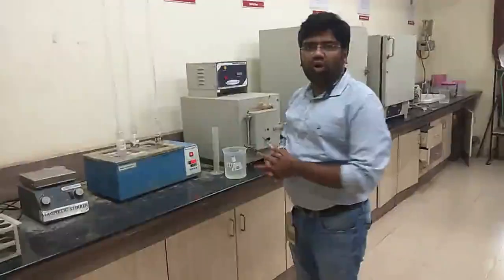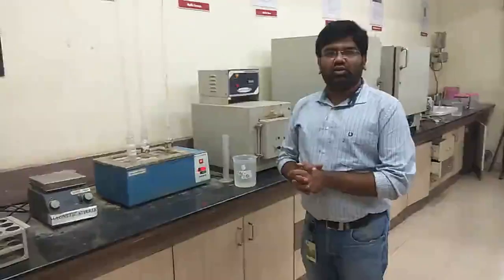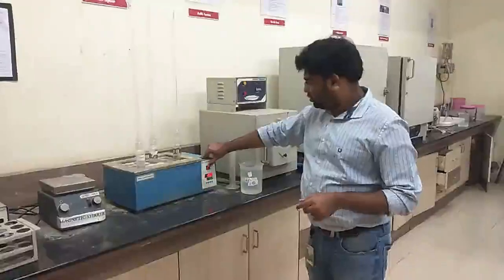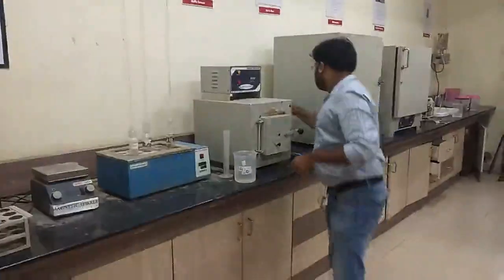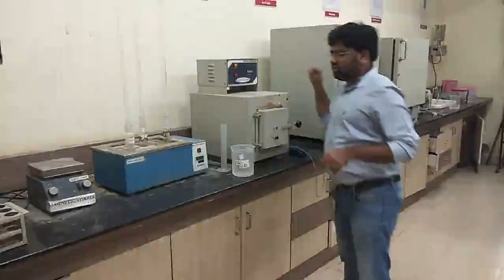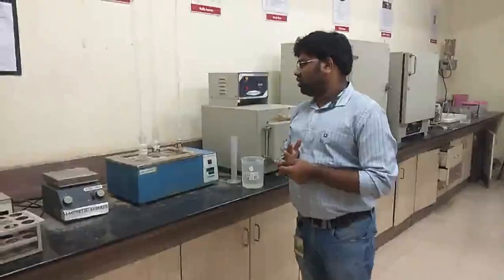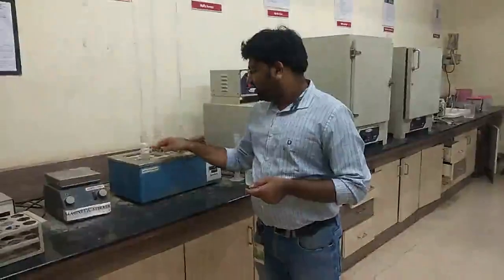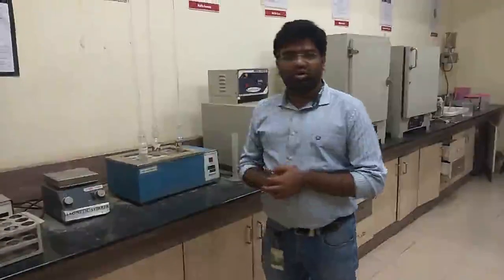So we have completed 2 hours of digestion, right? We are going to switch off this digestion process. Now the next step is to settle all the fumes inside this COD digestion flask.